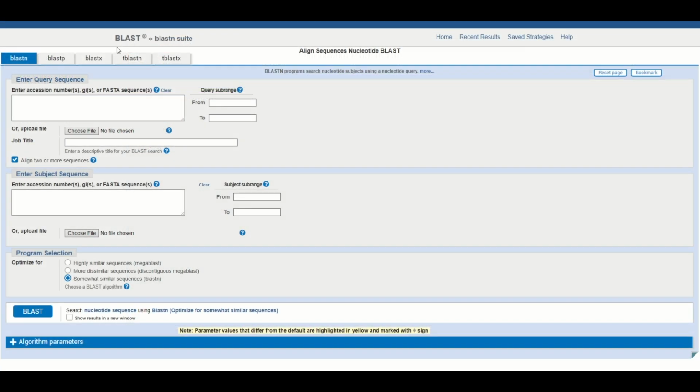All right, so go to the BLAST website, nucleotide BLAST, and you can align sequences in here fast and easy without an account. At this point, Benchling is such an easy alternative that you can use on any computer. I kind of don't see the point in using BLAST anymore. You can decide what you want to do, but you'll see in a sec. It was great for its time, but there's new stuff.